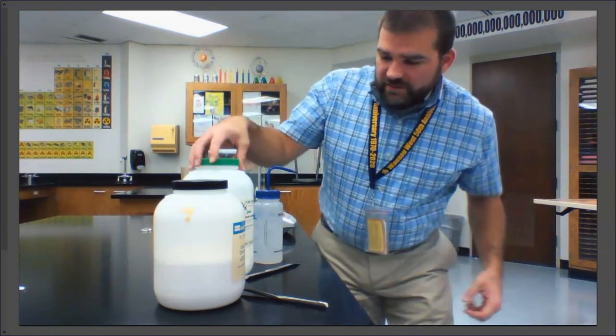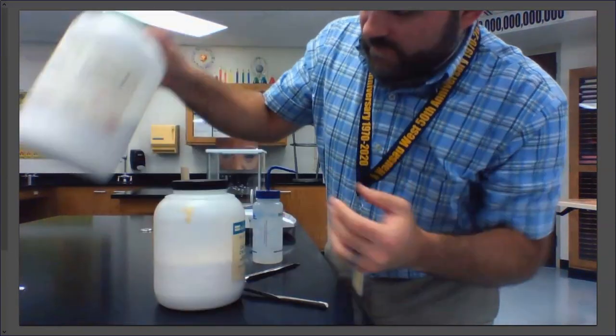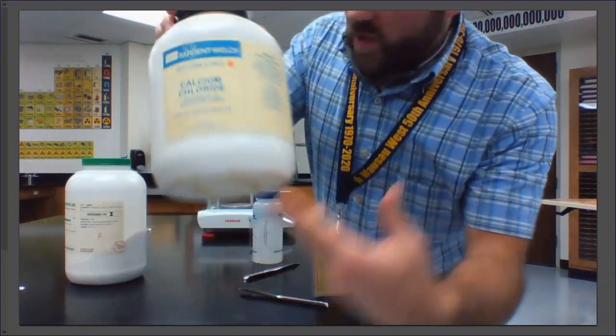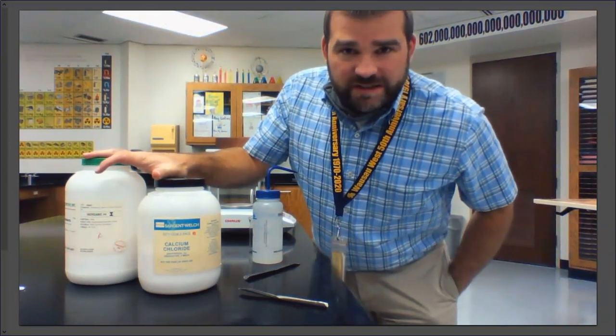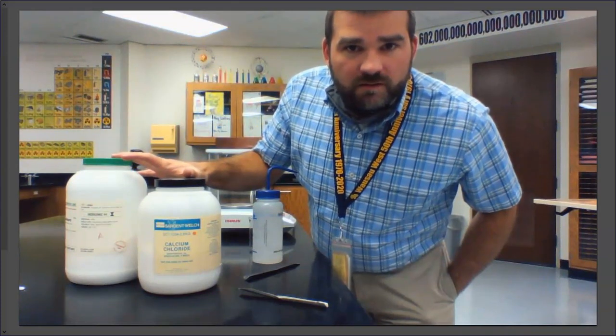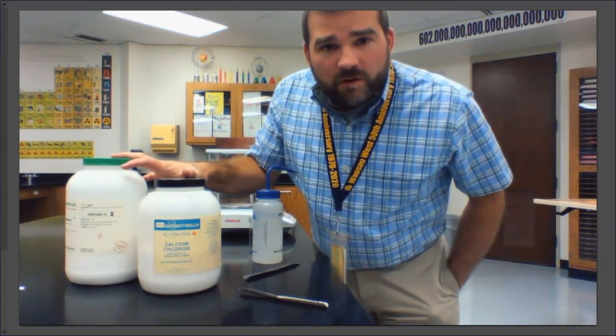All right, so today we are going to be mixing sodium carbonate and calcium chloride. These are both just salt compounds. We'll talk a whole lot about salts later in the year. Don't worry too much about that definition just yet. But we're going to be dissolving both of these in water and then reacting them. The result of this chemical reaction is going to be what's known as a precipitate.